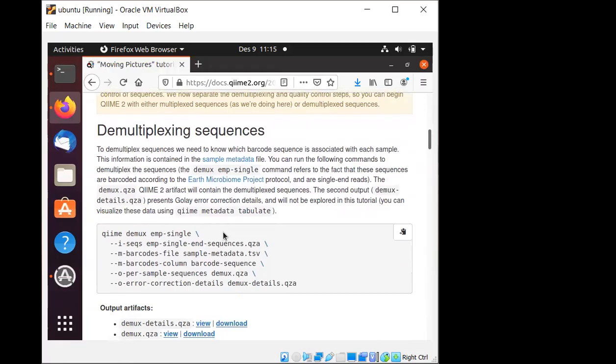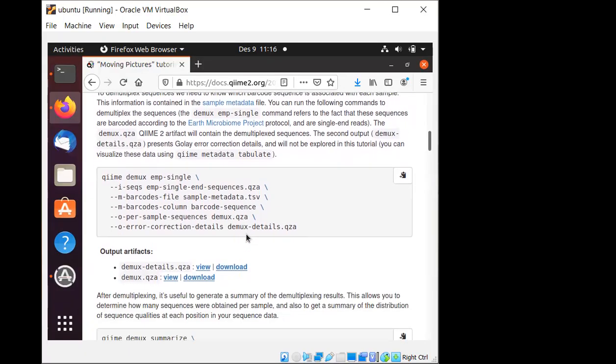Again, you will need to look for the sample metadata. Why do we need to do the multiplexing? It is usually done because we have a lot of samples and we just have one machine. Just for efficiency, you want to run every sample in just one run on that one machine, so you usually add the barcode. Then we need to demultiplex them and sort them out based on the barcode, so they can be in their intended place.